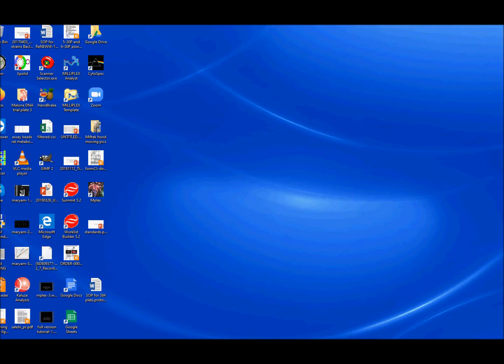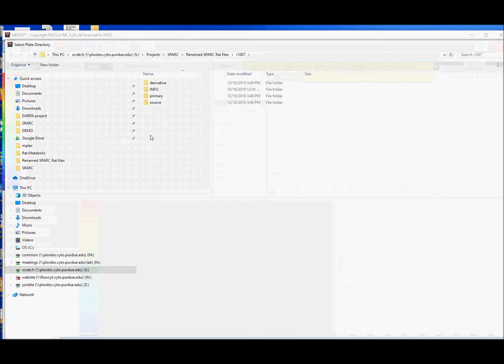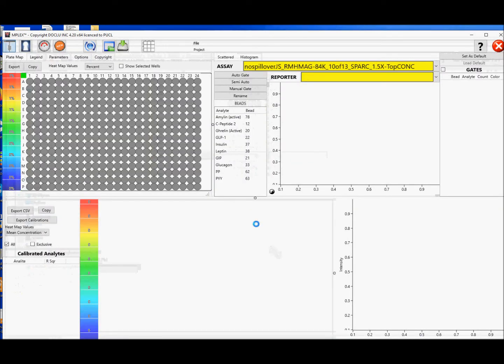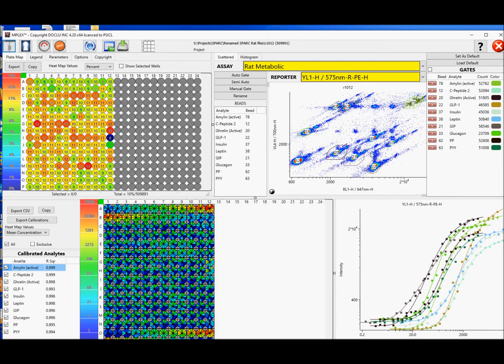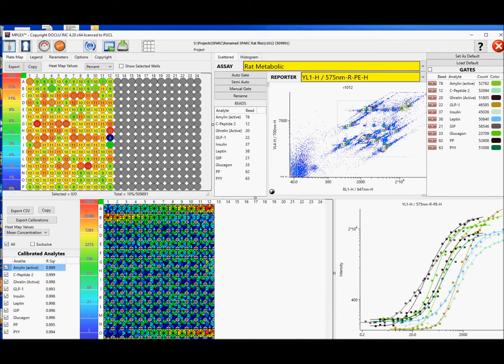The same process is followed for hormone data using Luminex type beads. Open the program by selecting the correct directory, and the software opens all the files associated with that directory and displays the last used analysis. If you zoom in on the beads, you can check that they are correctly associated. Now all you have to do is output the results.